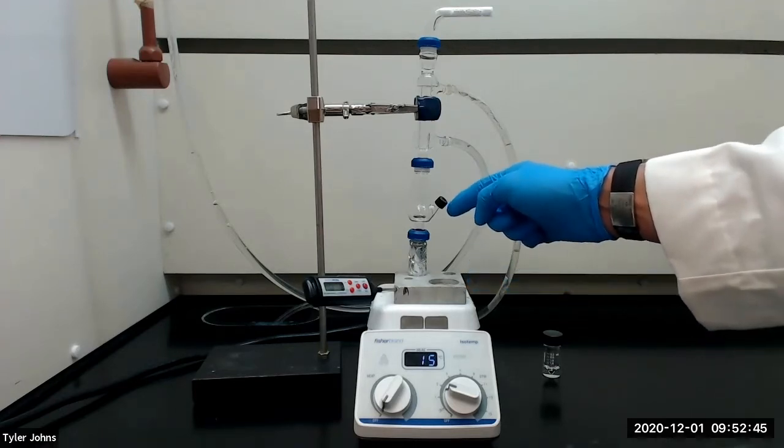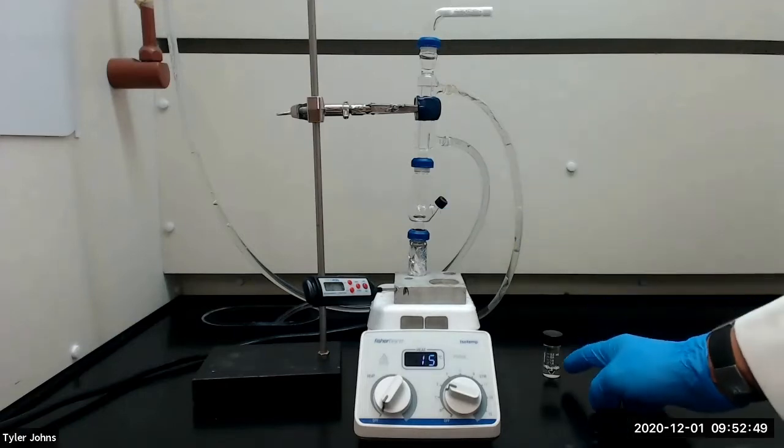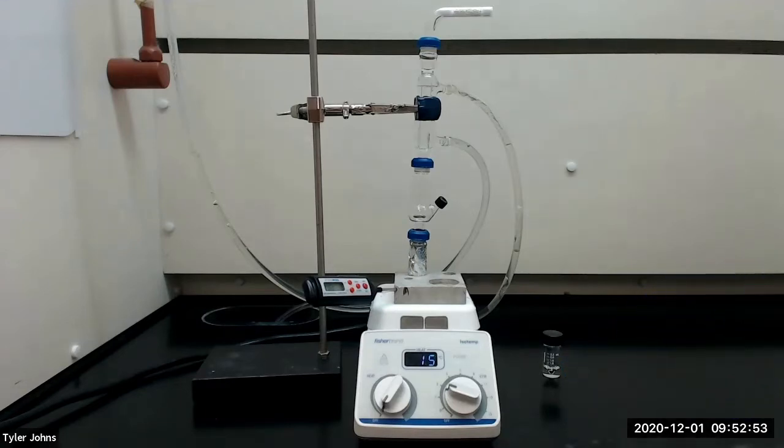We will collect the distillate from the side port of the Hickman head using a pasture pipette and transfer to a new 3-milliliter conical vial. We will continue the distillation until the product is no longer being distilled.